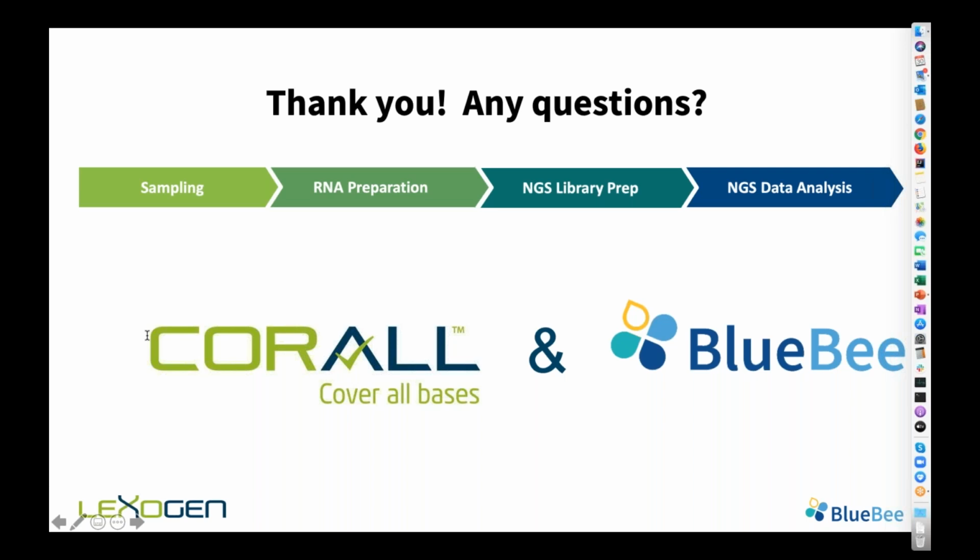Okay, and then we have a question which actually came from somebody who submitted it during the registration, and it was, could we find alternative splicing on cancer genes from RNA derived from blood? Can we answer this here now? Or I think I can take over here. The CORALL pipeline is doing a standard analysis. Finding alternative splicing is not part of the pipeline, but as Andreas already mentioned, you can download the BAM files and then do your own analysis based on the BAM files, like doing a StringTie analysis on that.